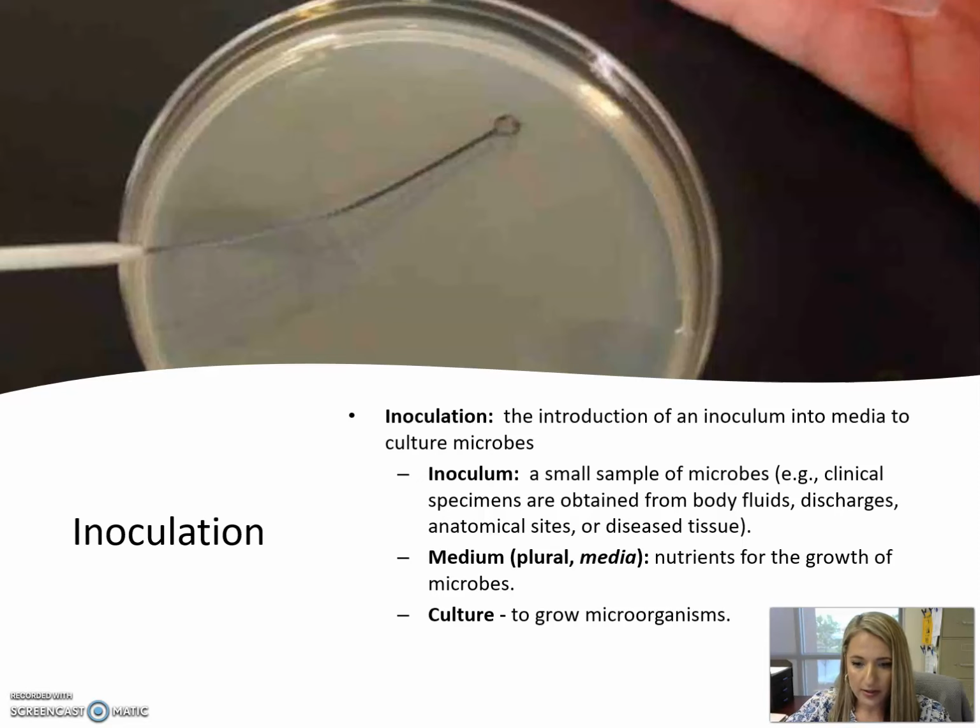And since microorganisms are ubiquitous and found everywhere, a sample or an inoculum could really come from any possible place imaginable. Definitely in a healthcare setting, they're from these kind of standard places, but in the context of our lab, they could even come from surfaces such as inanimate objects, or the skin, or potentially even things like food and water. So inoculation is the introduction of an inoculum, or a small sample of microorganisms, into media.